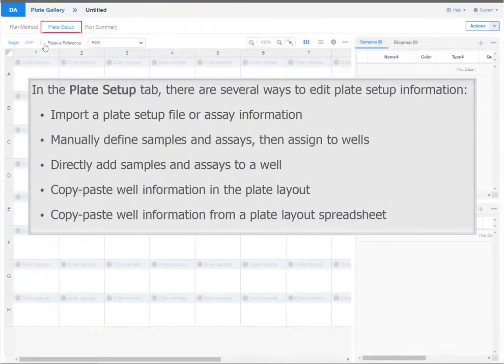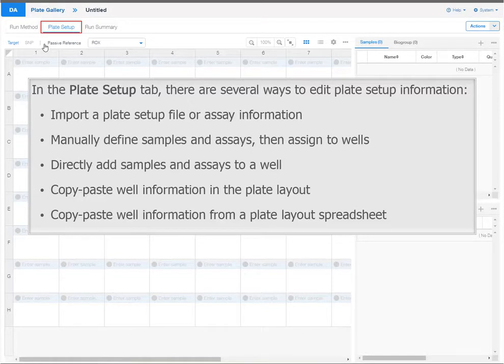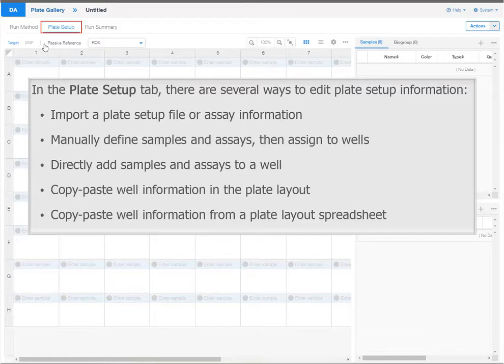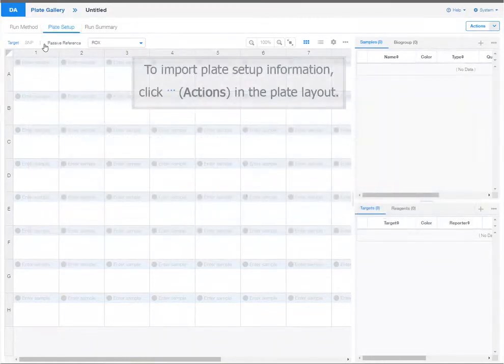In the plate setup tab, there are several ways to edit plate setup information: Import a plate setup file or assay information, manually define samples and assays then assign to wells, directly add samples and assays to a well, copy-paste well information in the plate layout, or copy-paste well information from a plate layout spreadsheet.